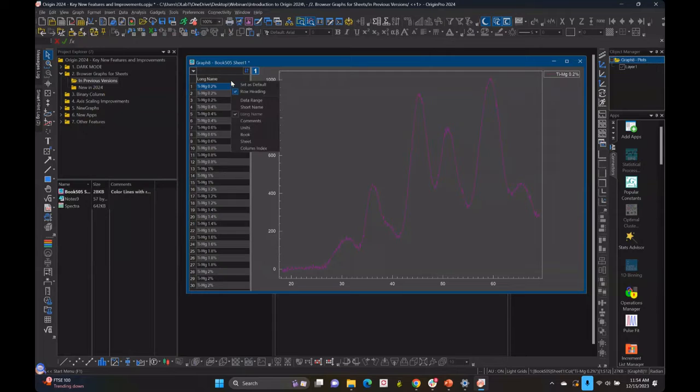I can right click here and say, show me also the comments. So I have all the metadata right in front of me. So then I can explore. I can say, how does the curve look at 800? How does the curve look at 1200?